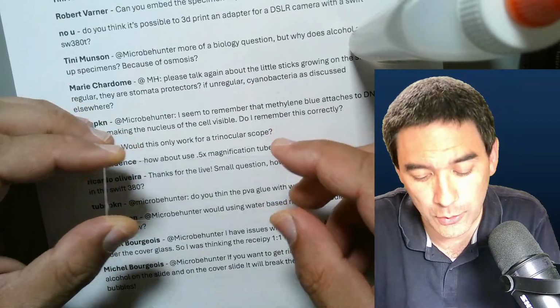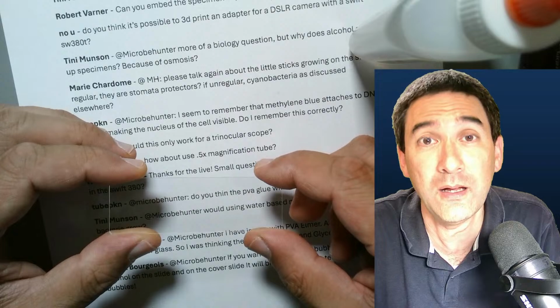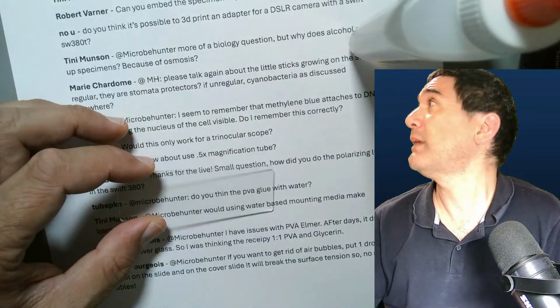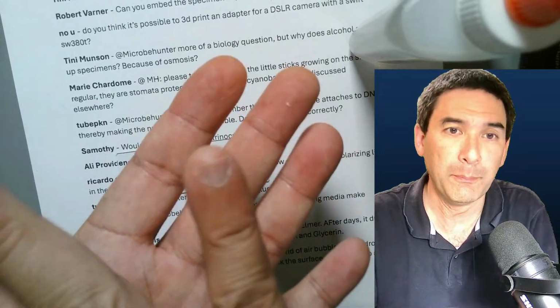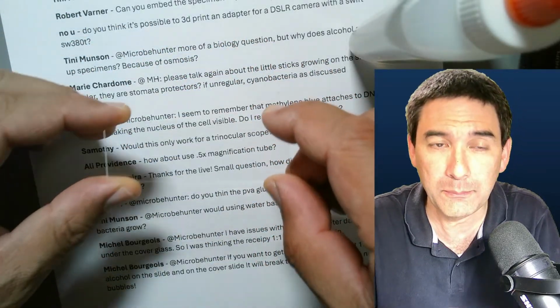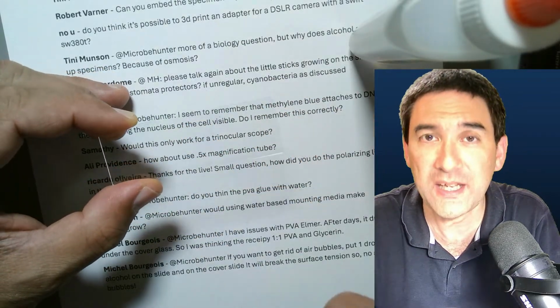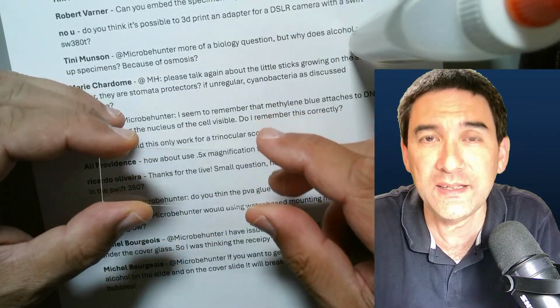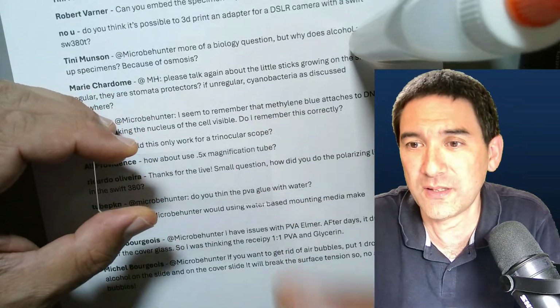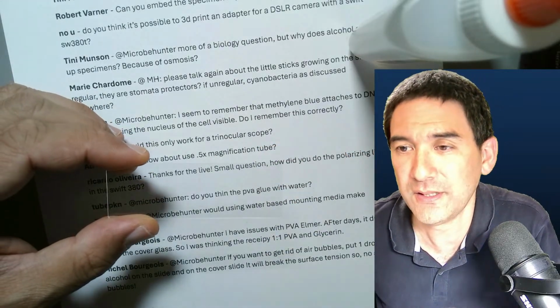So what you do is you take this slide and you put it into a plastic box which contains water. I don't have one here now, but you make it in a plastic Tupperware box. You make some kind of a rack where you can place the slide, and then on the bottom you have water. So the moisture is 100%, and this will actually prevent the slide from drying out. It's the German term, Feuchtekammer. It's a wet chamber. Yeah. So that's the thing.